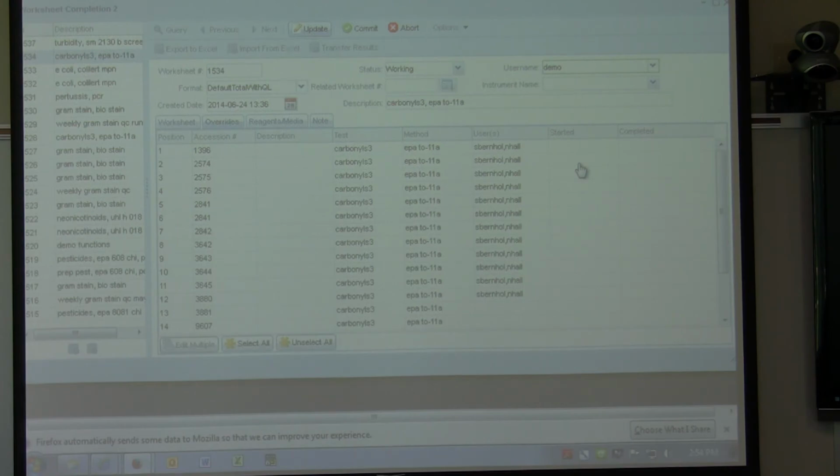So then, my understanding from Bill is that we can meet that timeline for instrument interfacing for the majority of your instruments. We've got about 80% of them that have completed their initial testing. I'm excited. So yeah, it's your busy season.